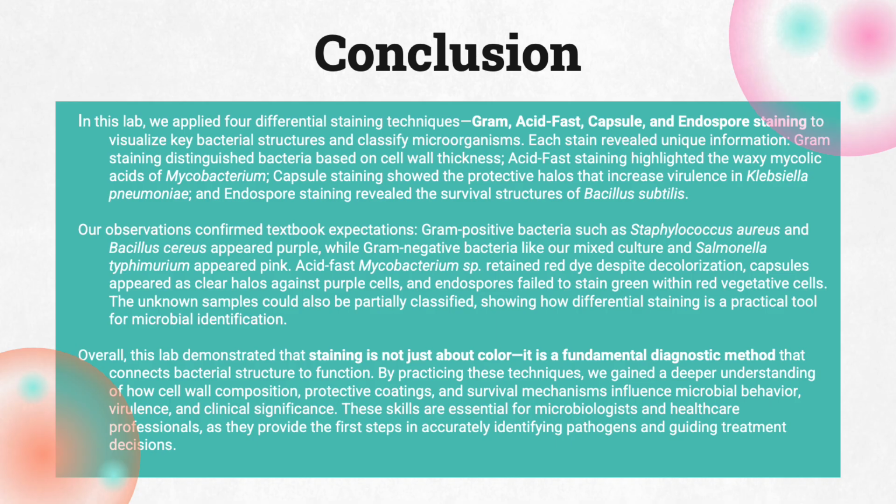Overall, this lab demonstrated that staining is not just about color, it's about fundamental diagnostic methods that connect bacterial structure to function. By practicing these techniques, we gained a deeper understanding of how cell wall composition, protective coatings, and survival mechanisms influence microbial behavior, virulence, and clinical significance. These skills are essential for microbiologists and healthcare professionals as they provide the steps in accurately identifying pathogens and guiding treatment decisions.